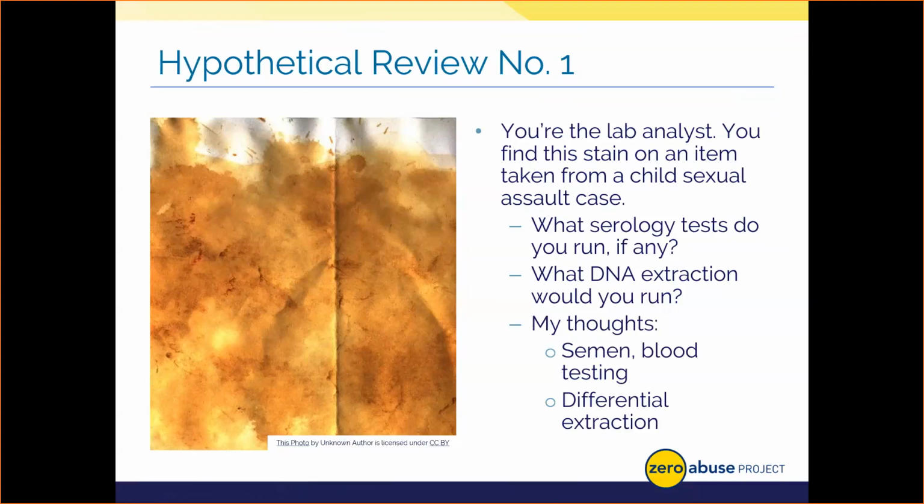At this point, I might go ahead. Someone mentioned saliva. I could do that. I think I would probably want a little bit more case information to see if I want to go ahead and run that too and see if amylase is present. There's so much sample here that, yeah, maybe if you're informed of that and you want to go ahead and process that, you could talk to your investigator and go ahead and maybe run that as a third test.